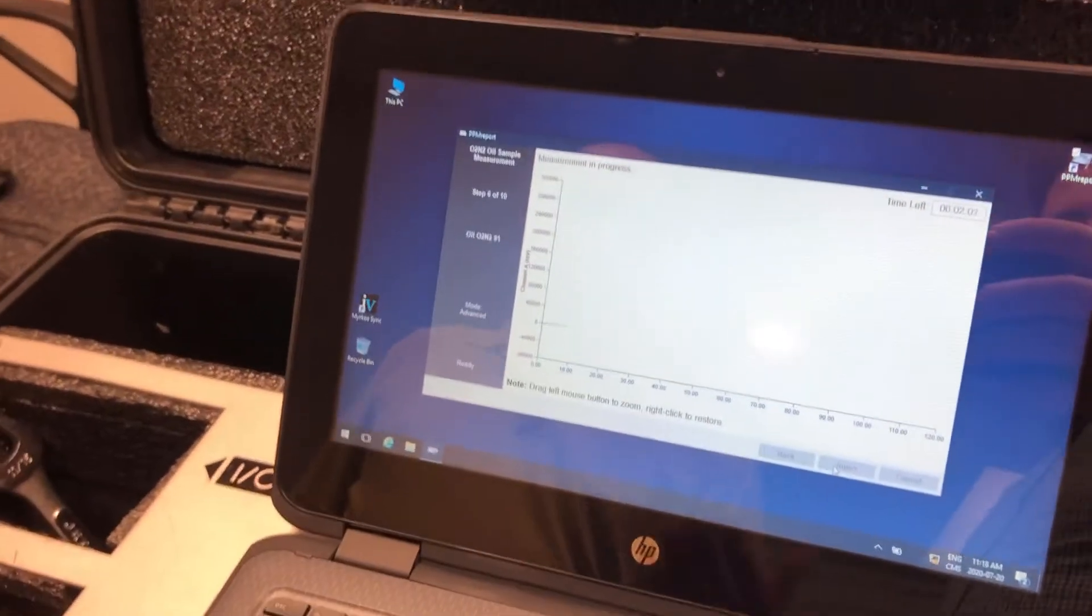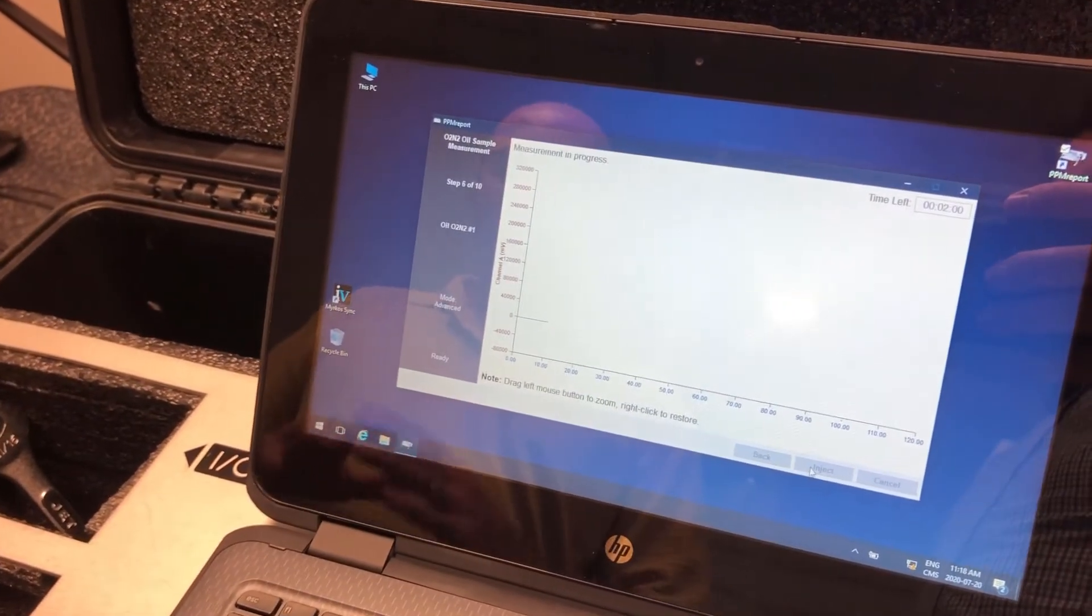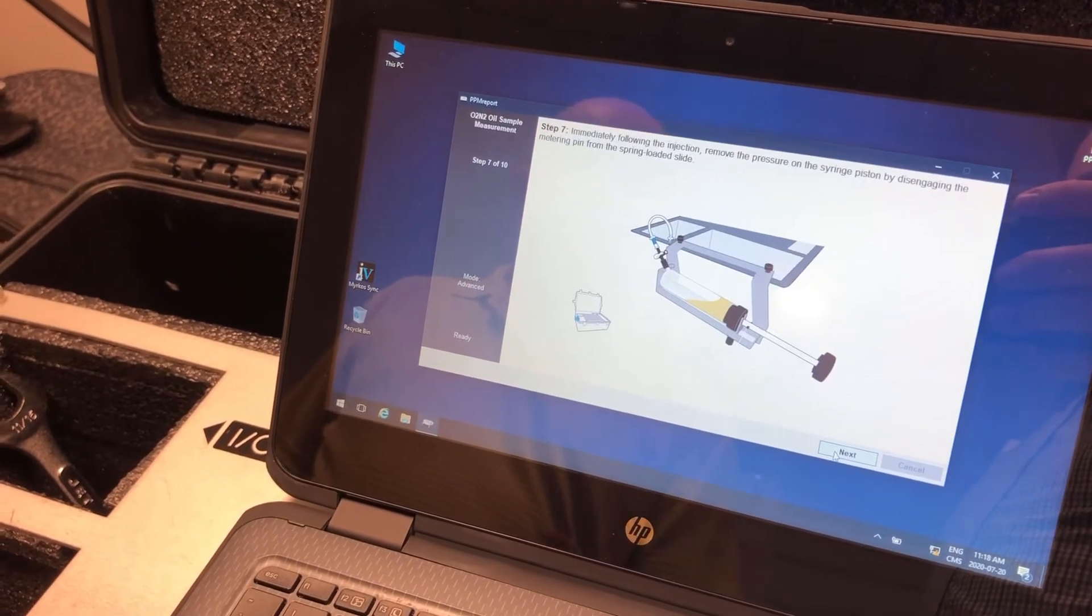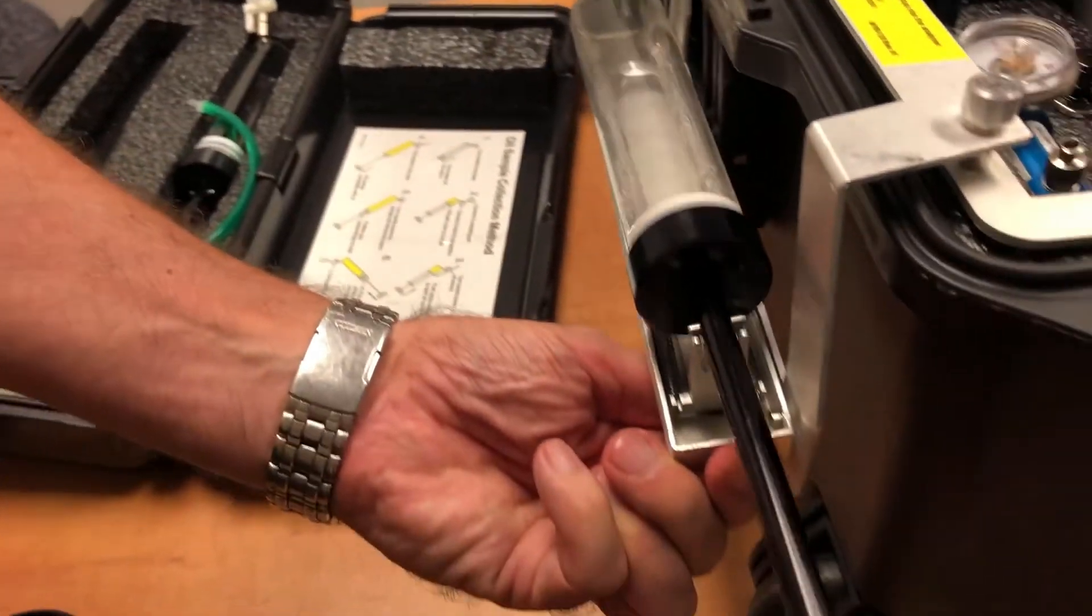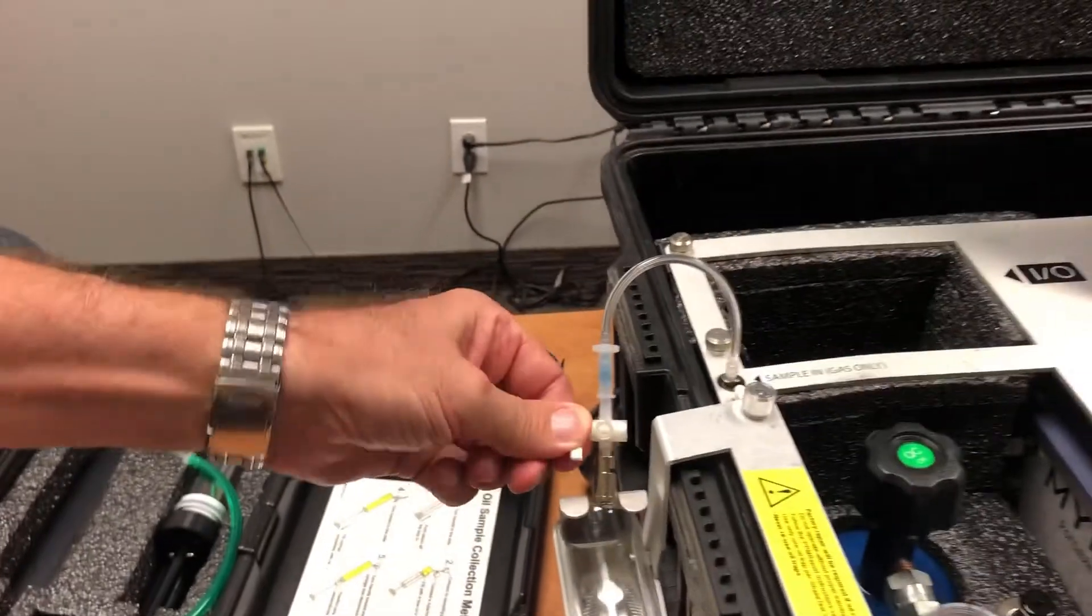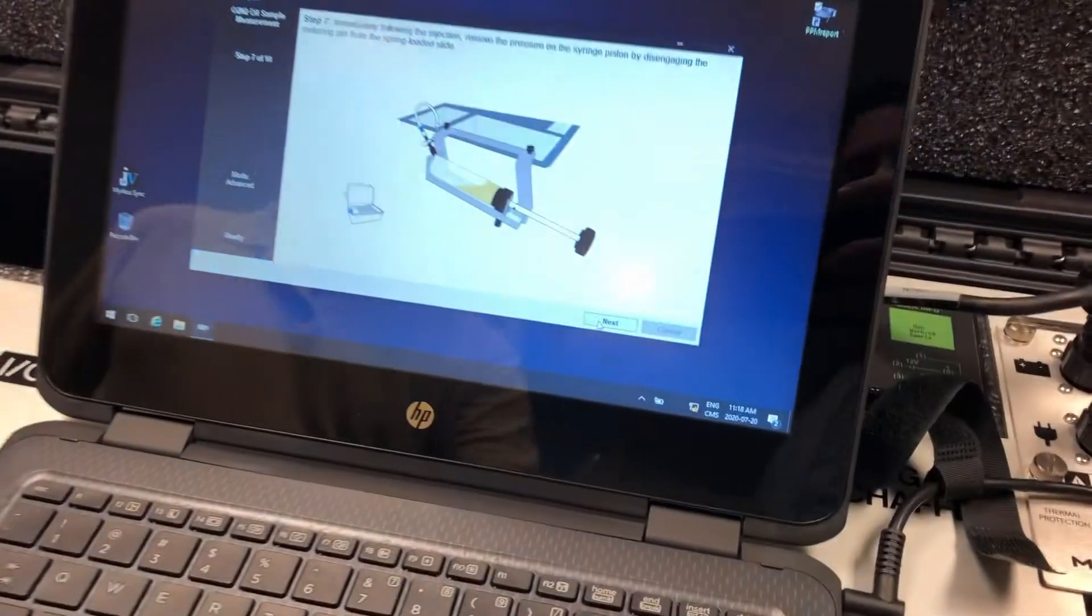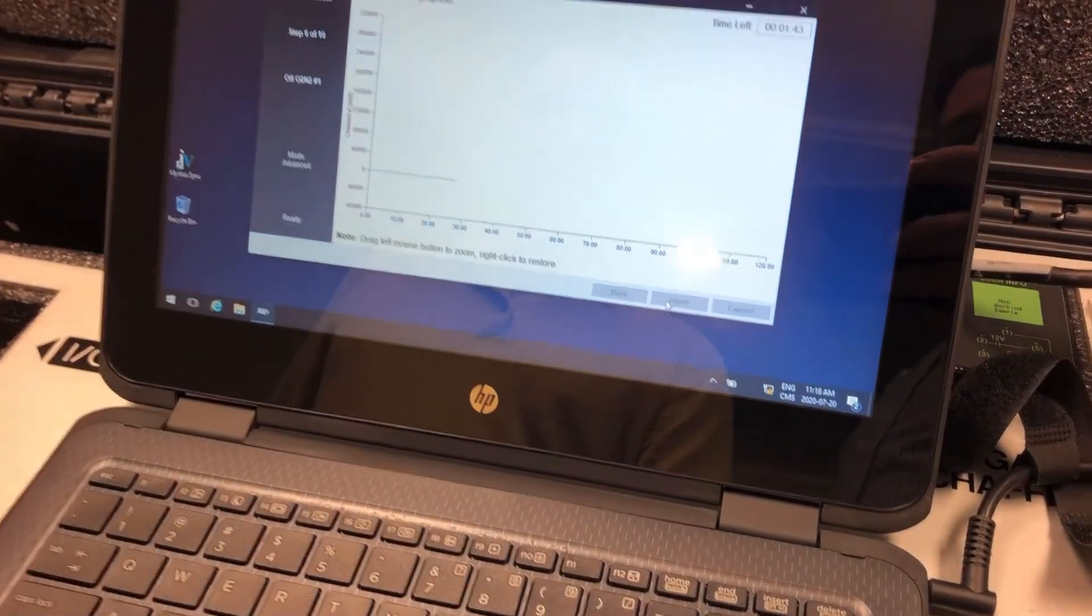That will be combined with the other seven gas, and then you have your full nine gas DGA analysis done by the Mirkos. So the next step again, like before, we remove the pressure on the syringe. You close the valve just as a precaution, and we're going to wait for the results.